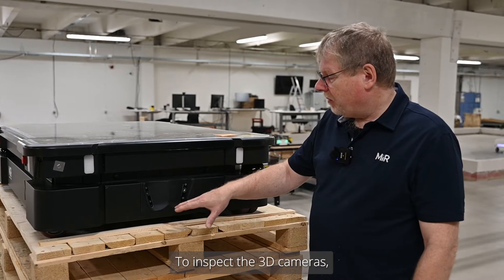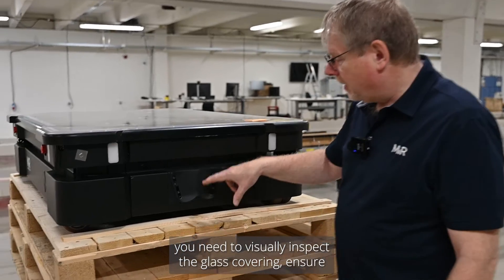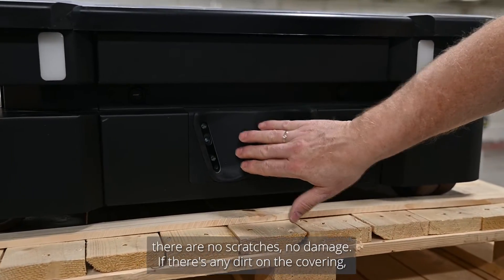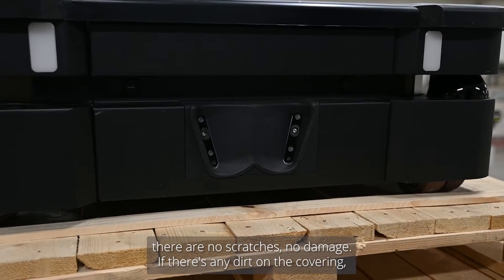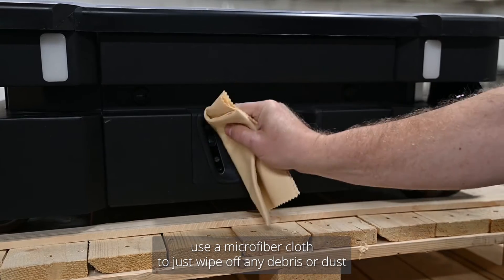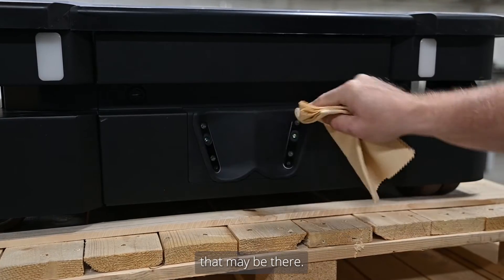To inspect the 3D cameras, you need to visually inspect the covering — the glass covering — and ensure there are no scratches or damage. If there's any dirt on the covering, use a microfiber cloth to wipe off any debris or dust that may be there.